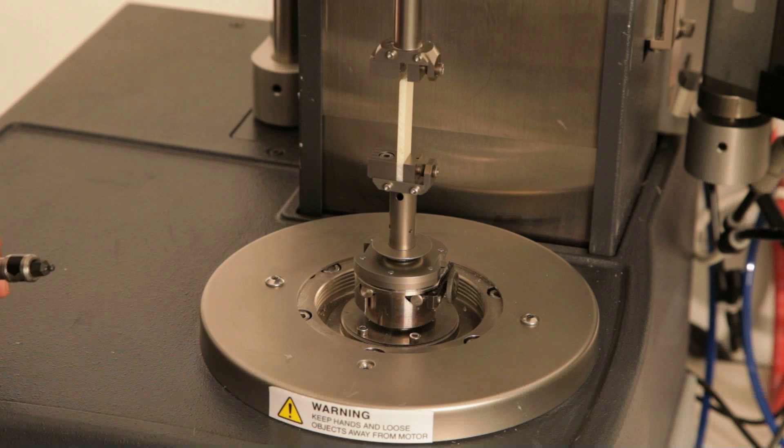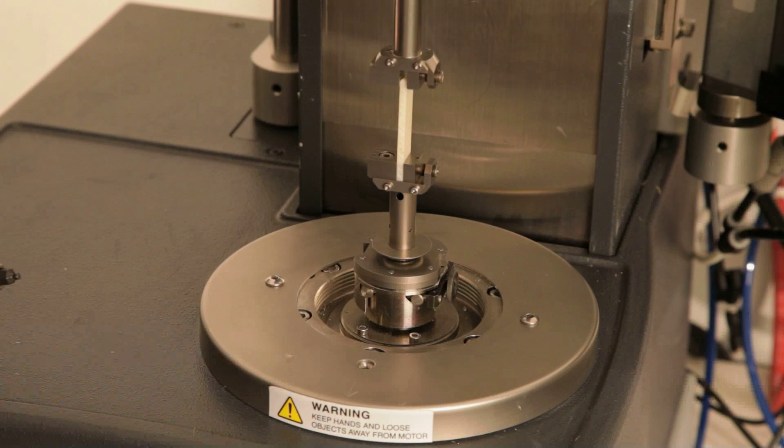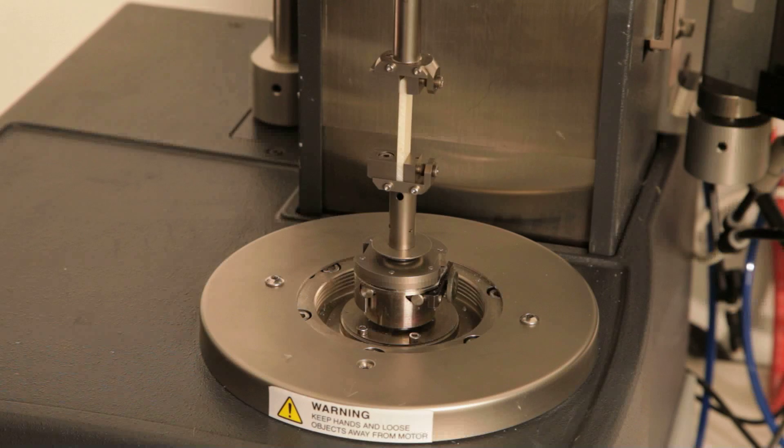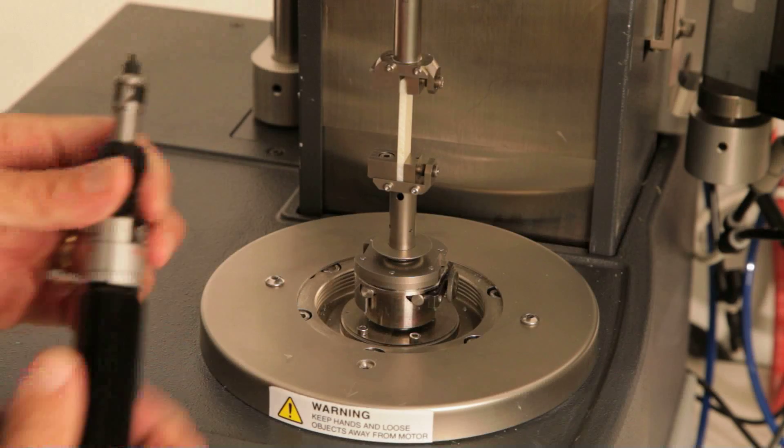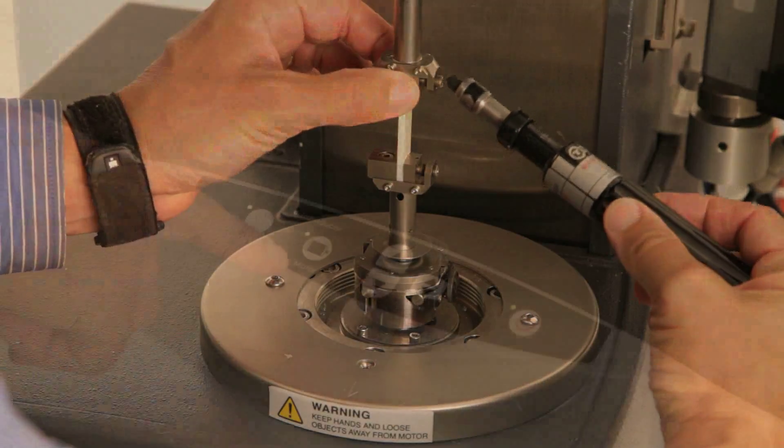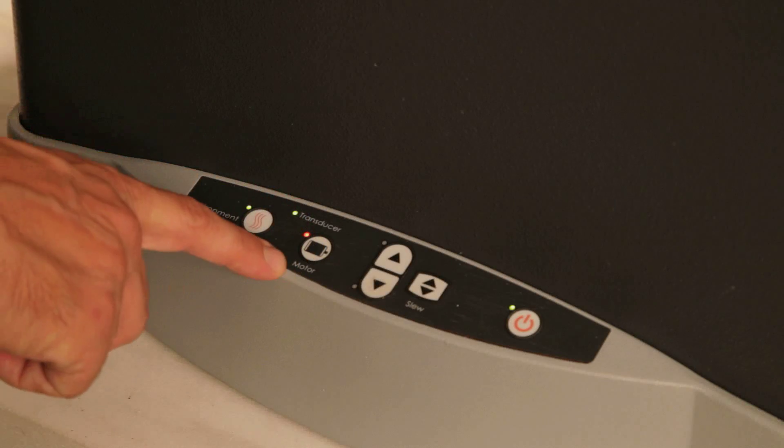Lower the upper stage and insert the top of the sample into the upper clamp. Center the sample into the upper clamp using the reference lines. Tighten the upper clamp with the lower clamp's motor off.